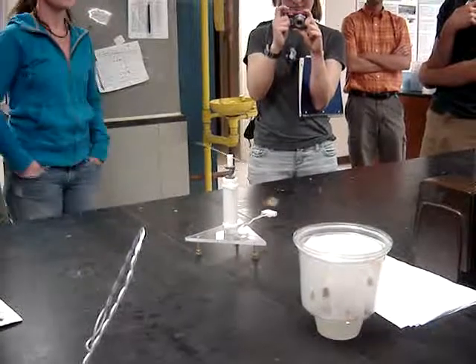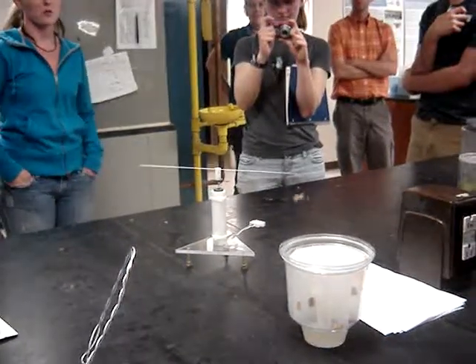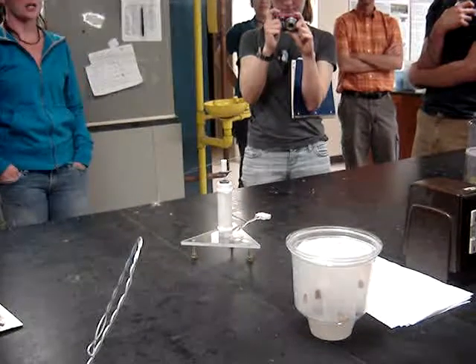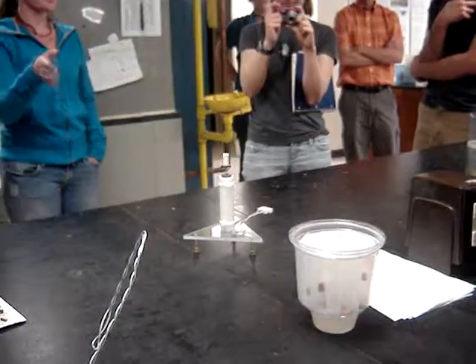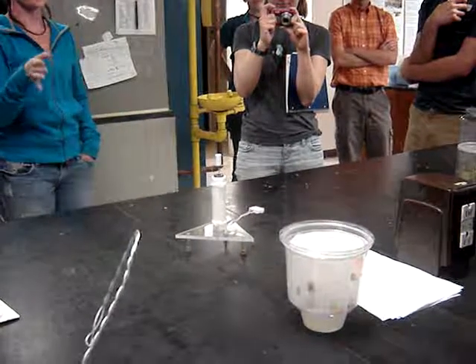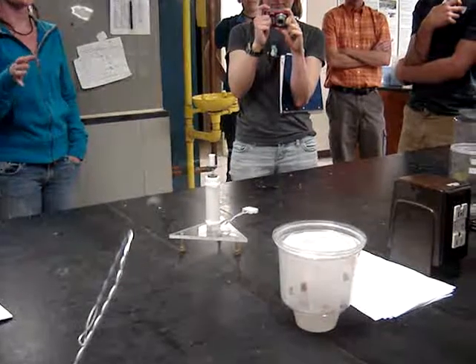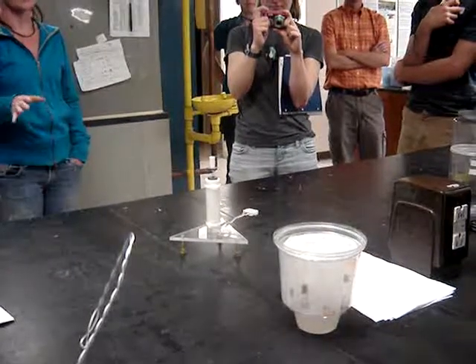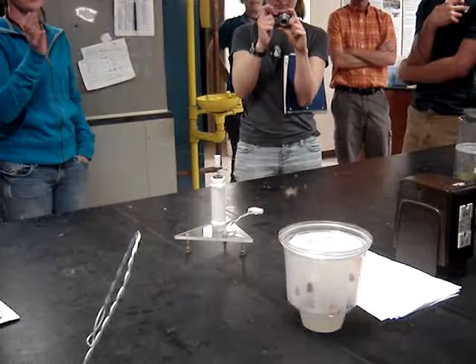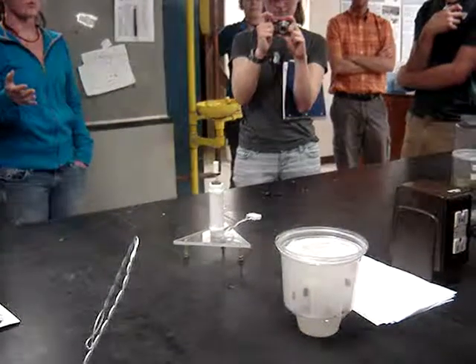They can survive up to about 24 to 30 days depending on conditions. When they're on the flight mills I'm only running them for a certain amount of time — during my reproductive study I flew them 6,200 feet, that was it. Then I take them off, let them mate, and with the pesticides we ran them as well.